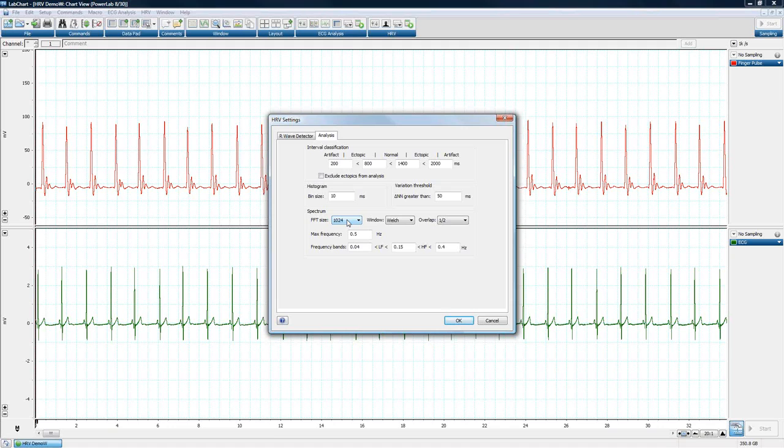The higher the FFT size, the better frequency resolution you're going to have, the more precise you are on specific bands. The lower the FFT size, the better amplitude resolution you have. What's good or bad? Default is 1024, but whatever works best for you. Is amplitude more important to you, or is frequency resolution more important? And make your decision according to that.